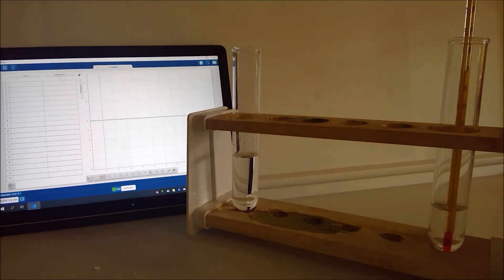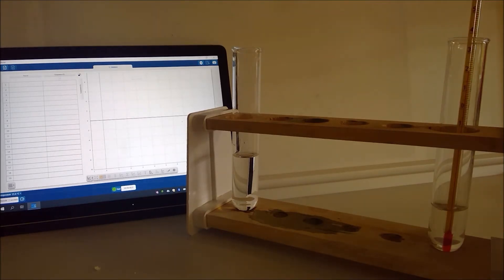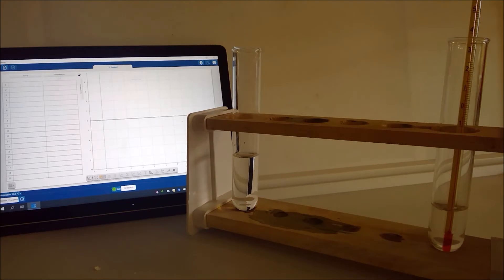So next instruction on the practical sheet then is to pour the sodium hydroxide solution into the acid stirring gently with a thermometer and we're going to record the highest temperature reached and record it in the table.